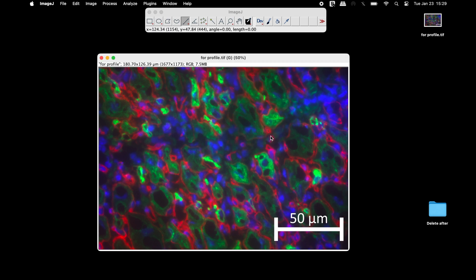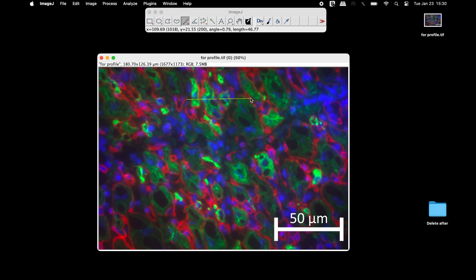Next, select the line tool from the ImageJ toolbar and draw a line in the image to select the region of interest.